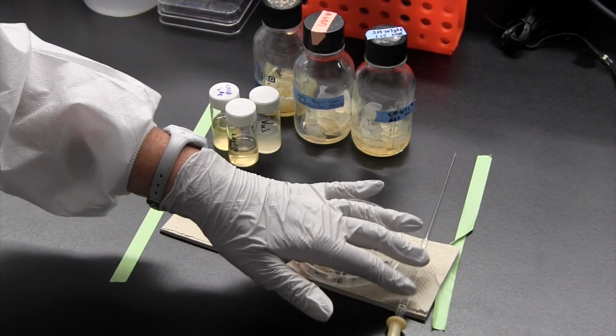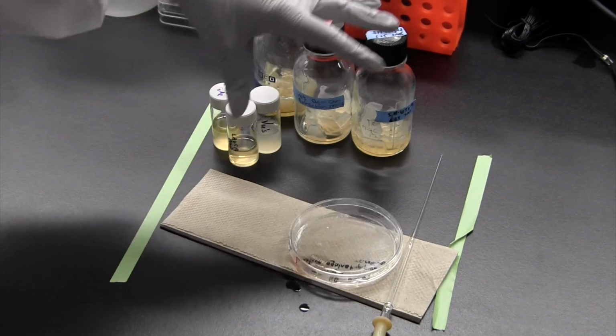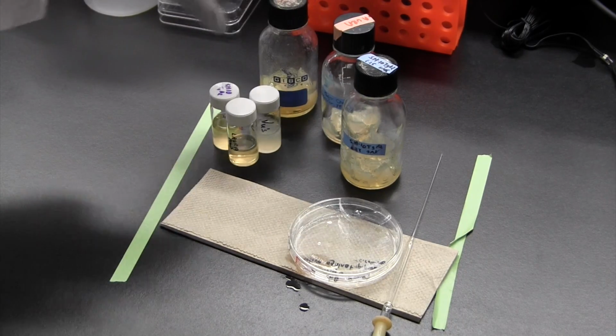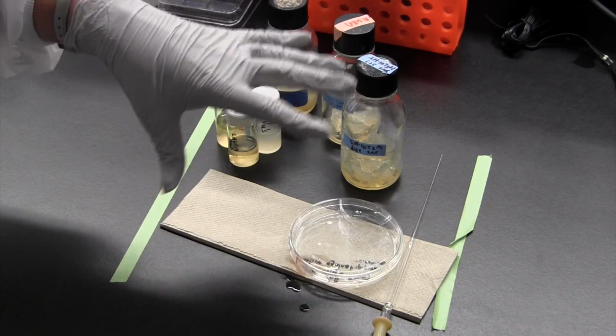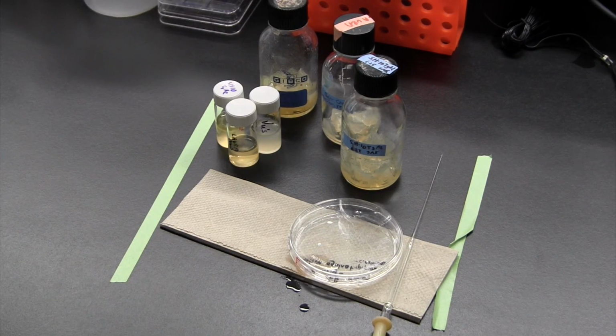Your glass pipette can just go into glass waste, obviously, but these are the things that are a little bit more questionable, which are the agar remnants in your glass bottles that still have solvent in them, as well as the aqueous layers of your extracts that you're not using. So the easiest thing to do with all of these is to take all of the caps off, let them sit in the hood, and let that ethyl acetate evaporate off.